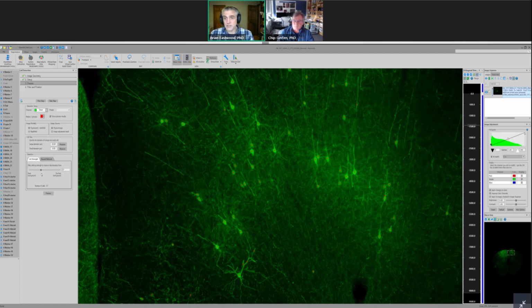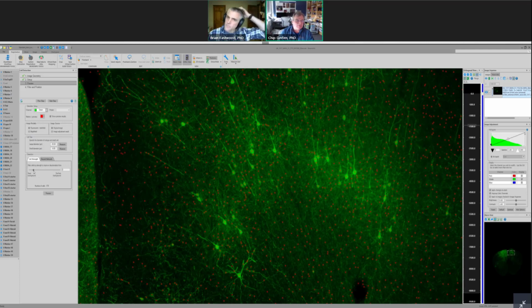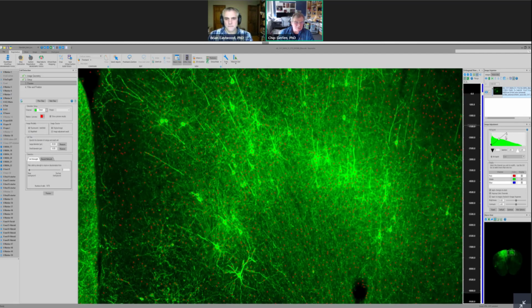The idea with that slider is to adjust it in a way that balances finding the objects of interest while eliminating most of the objects that are not of interest. So I'm moving this, the cell strength slider. If we apply no filter, this is showing all of the objects that have been detected, and you see that it shows a lot in these areas. You might think, well, this is just black, there's nothing there. But in fact, the program is sensitive enough that there is some intensity in those levels. It's just very low. These are like molehills. These are like mountain peaks.